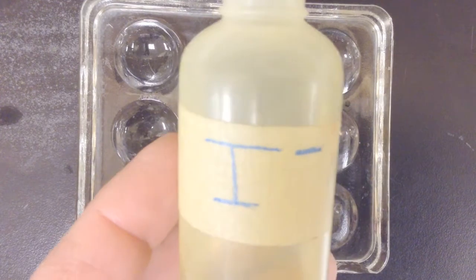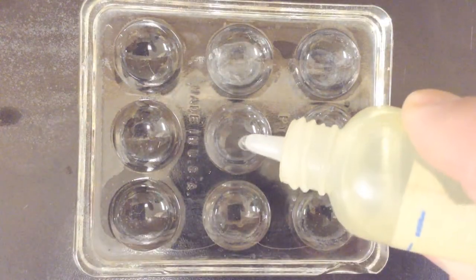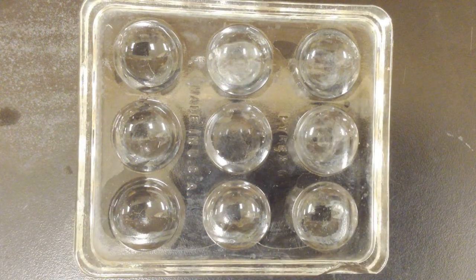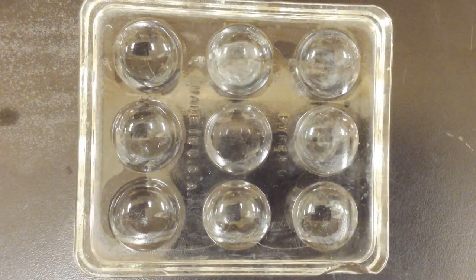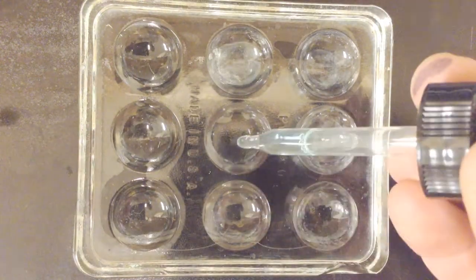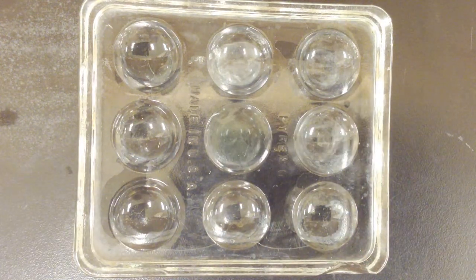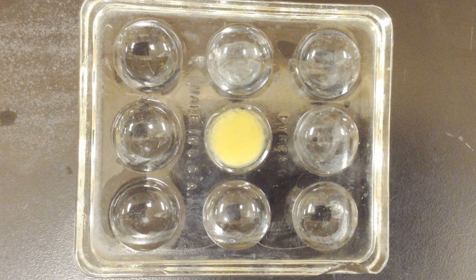So just because our lab looked like there was some contamination of the reaction plate, I'm going to take iodine 1-, so iodide ions, put them in the middle well, and here I've got my copper 2+ as well. Let's give this one little test again to see, because that yellow is kind of weird. So you can see as we mix them, well, it's not. So you can see something here has happened, that we actually didn't have any contamination.